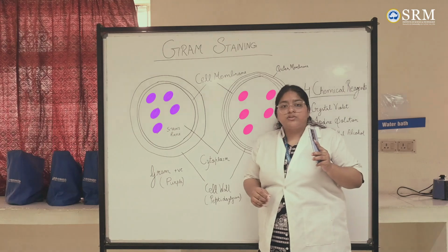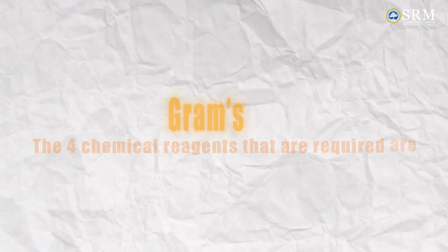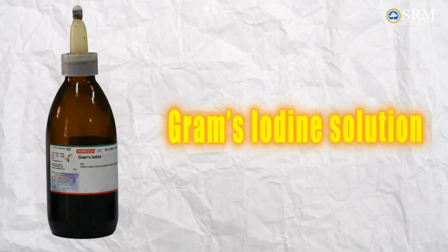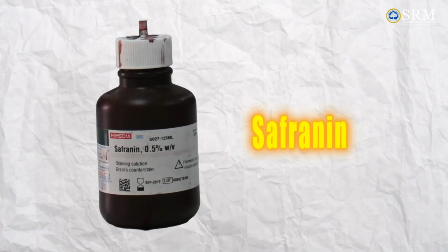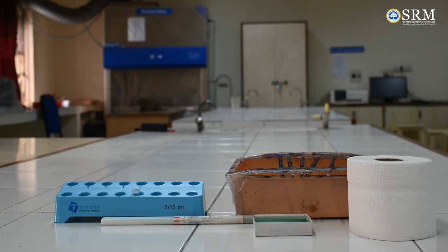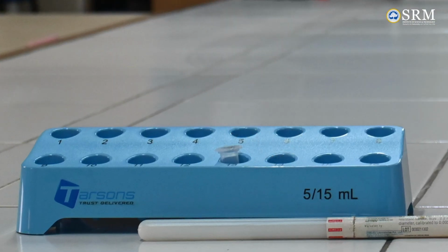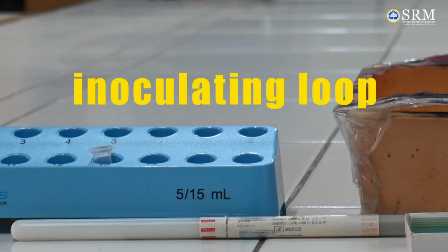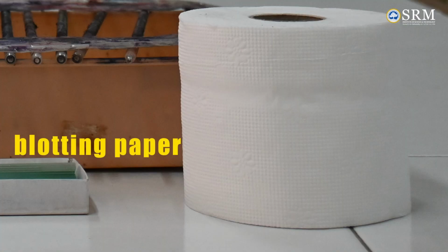So now we move to the materials that are required for this experiment. The 4 chemical reagents that we require are crystal violet, iodine solution, 95% ethyl alcohol, and safranin. We also require 18 to 24 hours old nutrient broth. The equipment that we require are inoculating loop, staining tray, glass slides, blotting paper, and microscope.